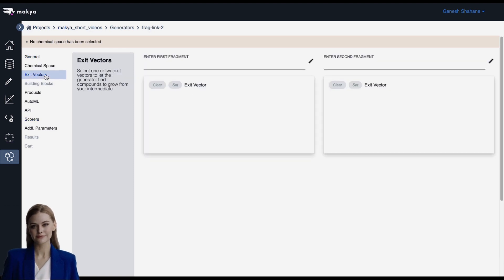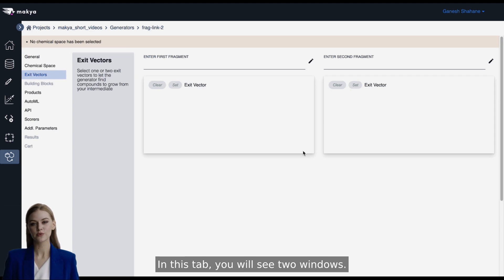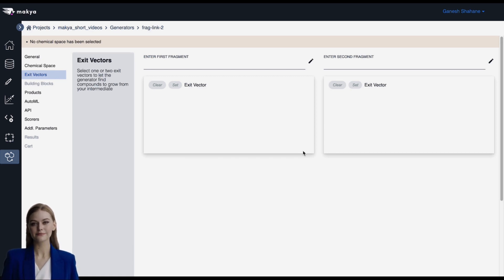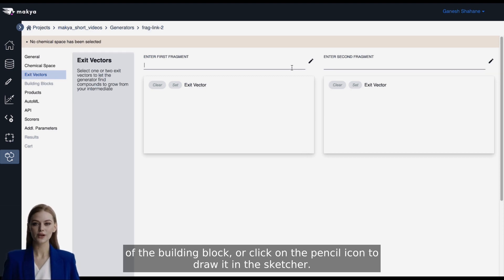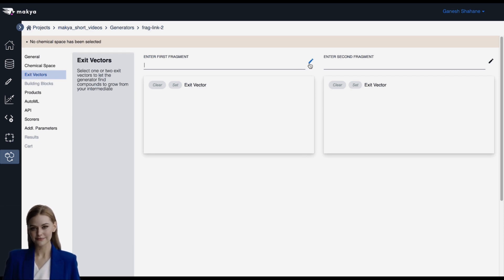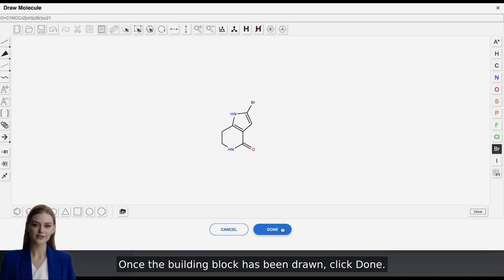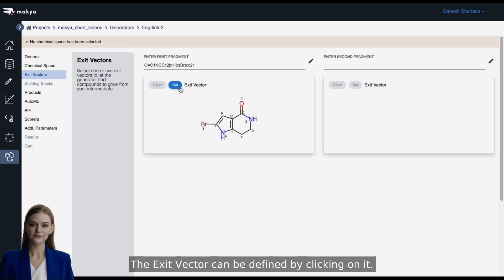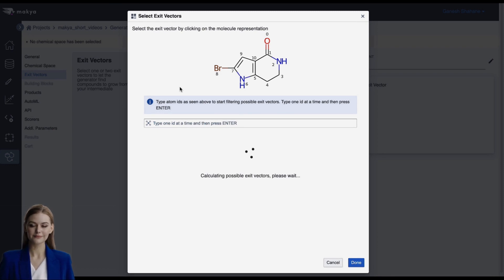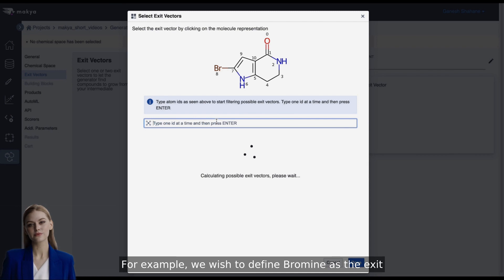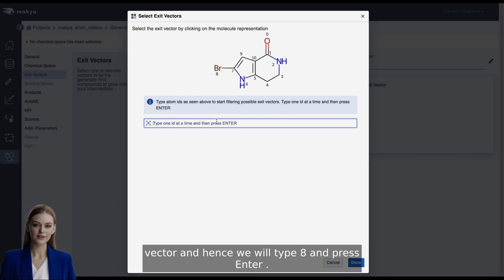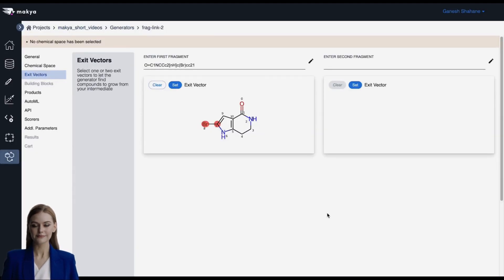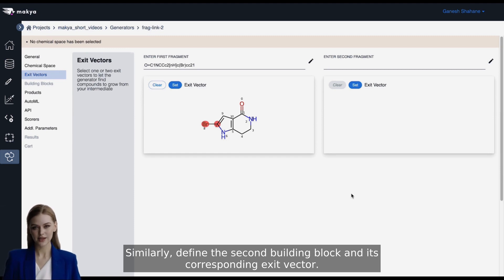Click on Exit Vectors. In this tab, you will see two windows. Each allows us to input one building block to which we wish to attach a scaffold. You can either copy and paste the SMILES of the building block, or click on the pencil icon to draw it in the sketcher. Once the building block has been drawn, click Done. Once the building block is defined, the Set button becomes active. The Exit Vector can be defined by clicking on it and entering the corresponding Atom ID. For example, we wish to define Bromine as the Exit Vector and hence we will type 8, and press Enter. Click Done. Similarly, define the second building block and its corresponding Exit Vector.